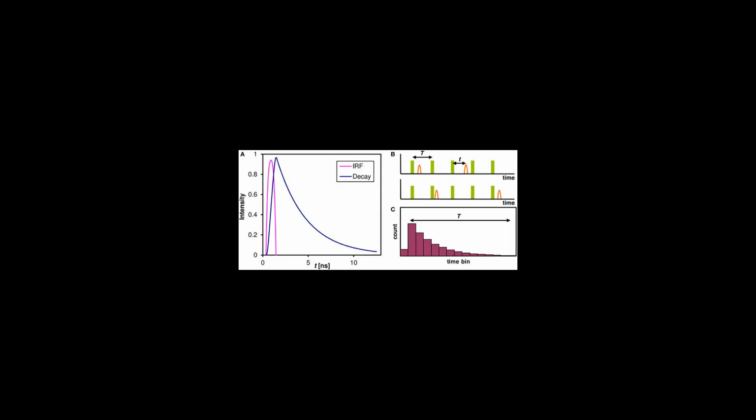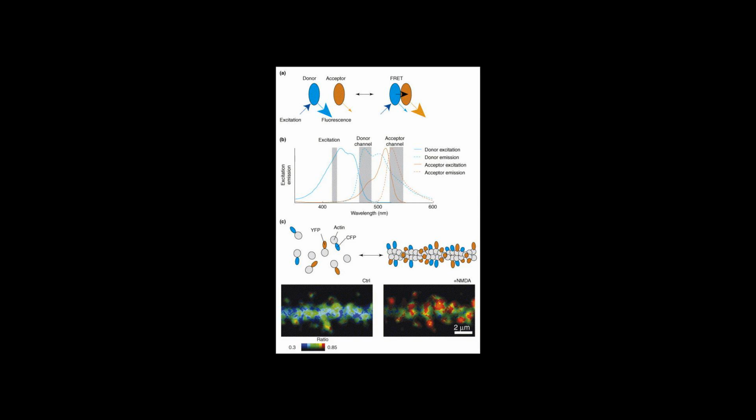Thus, FRET measurements using FLIM can provide a method to discriminate between the states, environments, of the fluorophore. In contrast to intensity-based FRET measurements, the FLIM-based FRET measurements are also insensitive to the concentration of fluorophores and can thus filter out artifacts introduced by variations in the concentration and emission intensity across the sample.